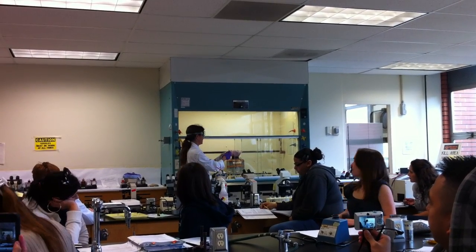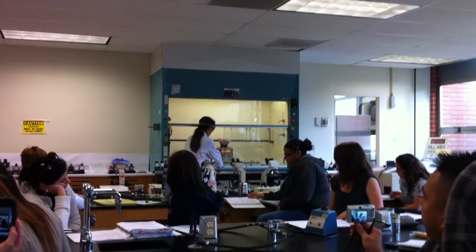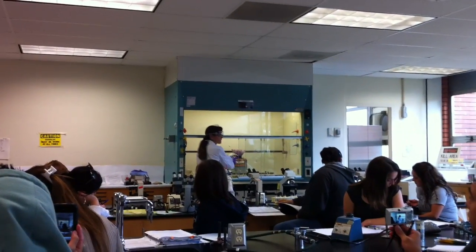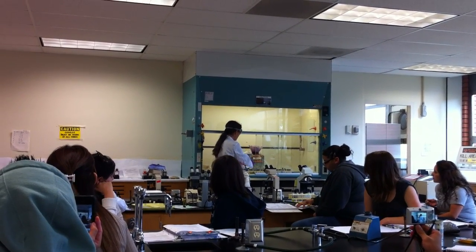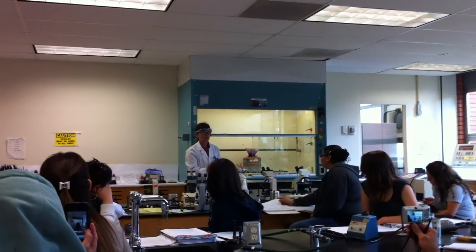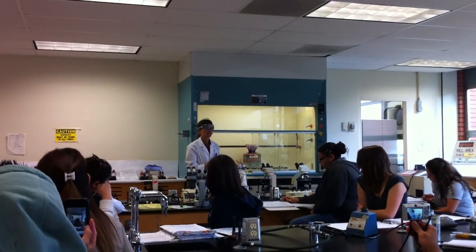Now what do I do? Let it sit for 15 minutes. I'm going to tap it lightly to mix it. And now I want to loosen the cap, right? We want air to have access. I'm going to leave my tubes up here for up to an hour, and I'll check my tubes about every 15 minutes.